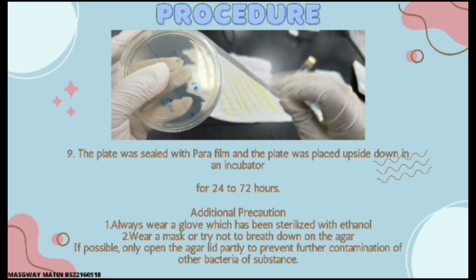Step 9, the plate was sealed with parafilm and placed upside down in an incubator for about 24 to 72 hours.